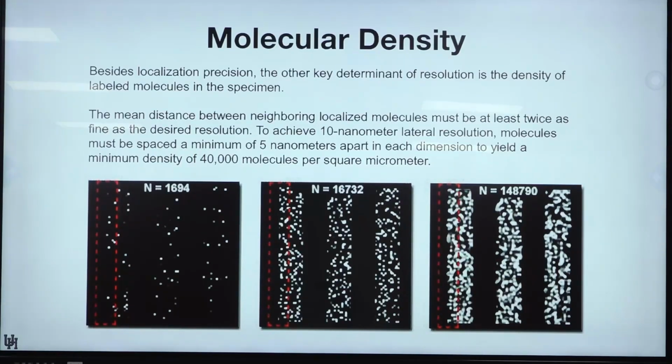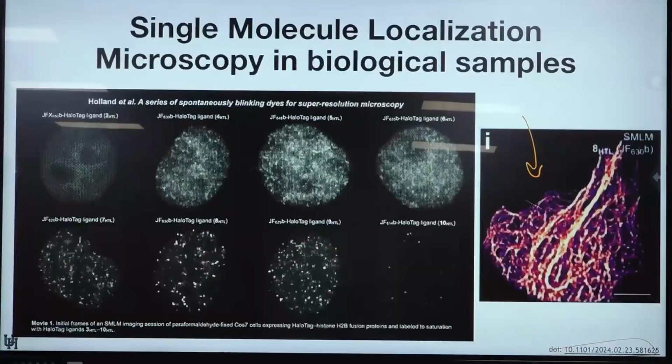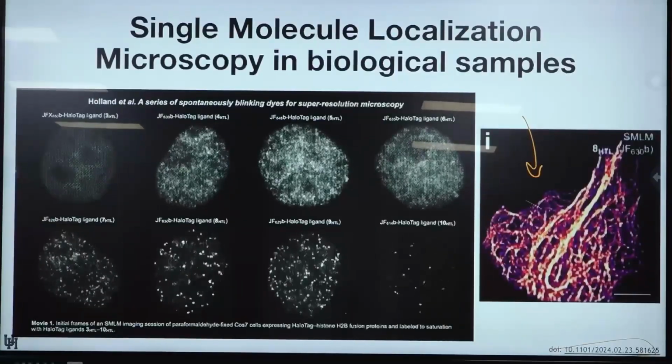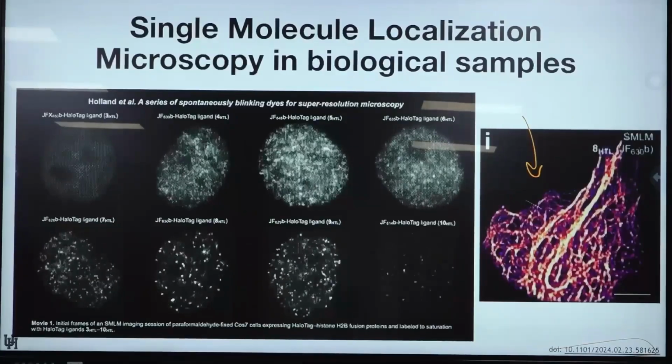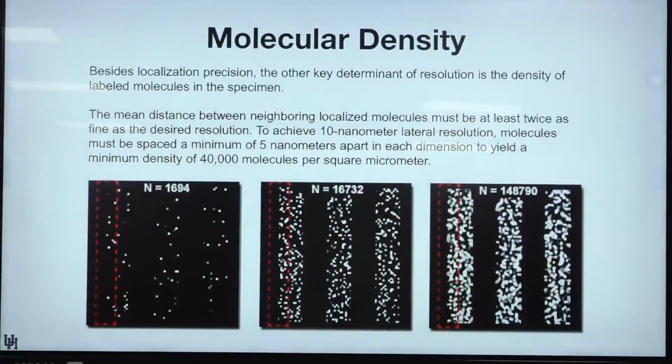These are what are called single molecule measurements. Literally, each one of these blinking spots is coming from one molecule. You're isolating separate molecules and connecting the dots. At any given measurement, it's basically a single molecule that you are getting the data from. One dot corresponds to one molecule. So as you increase the density of the locations of these fluorophores, you can construct better and better images. Any questions about this idea?